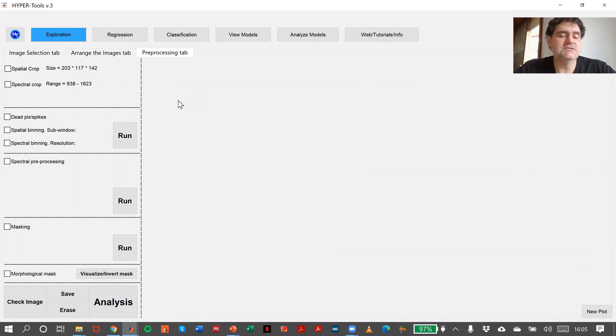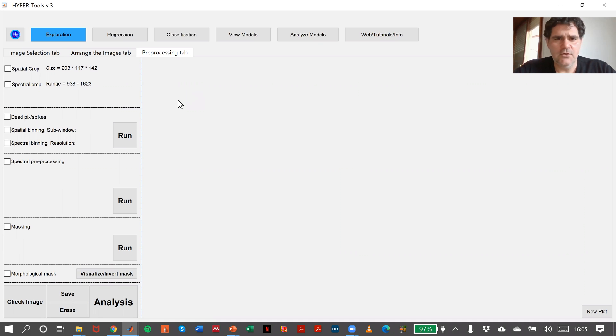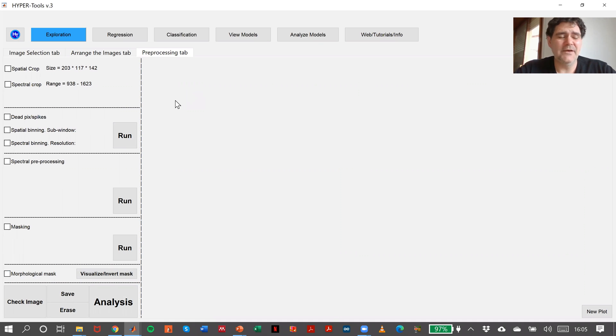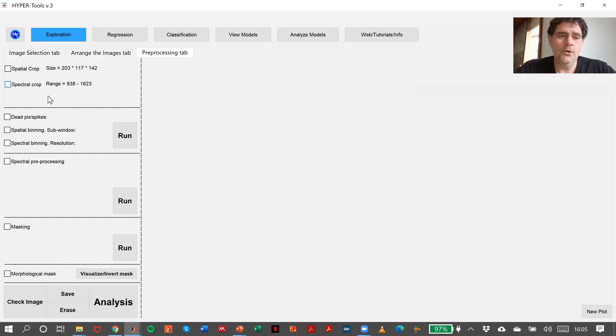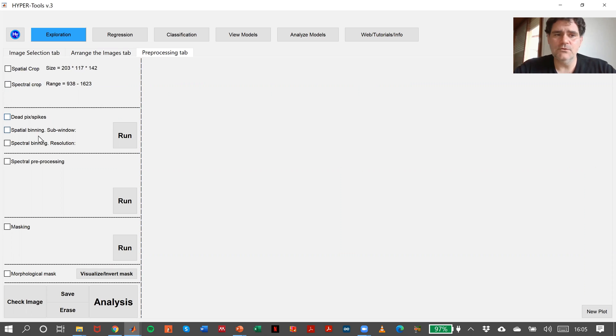But normally we need to do some preprocessing methods or tasks. In this case, in HyperTools, we have cropping implemented, spatial and spectral cropping. We have a tool for detecting pixels and spikes. We have also binning tools and spectral preprocessing.